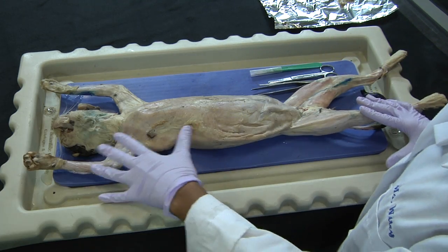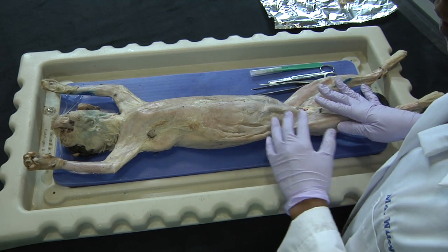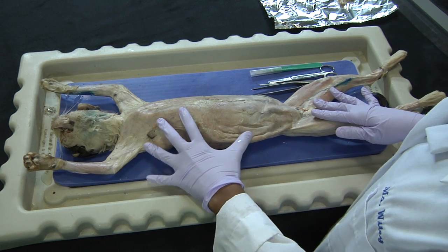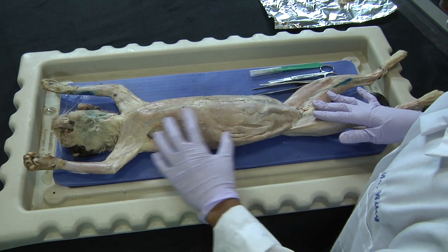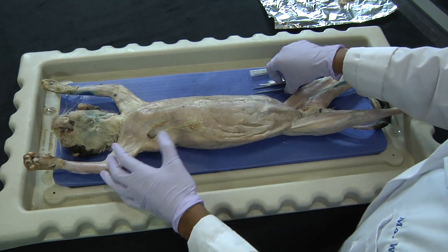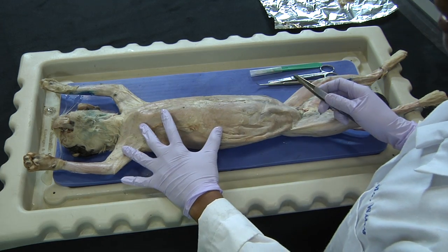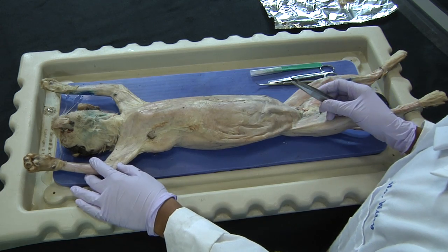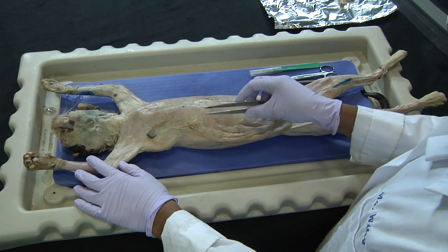In dissecting the cat, you can notice that the skin has already been removed. At this level, we are looking at the remaining connective tissue, and we can even begin to see some underlying muscular tissue. In order to really isolate the muscles, it is important to remove that connective tissue.